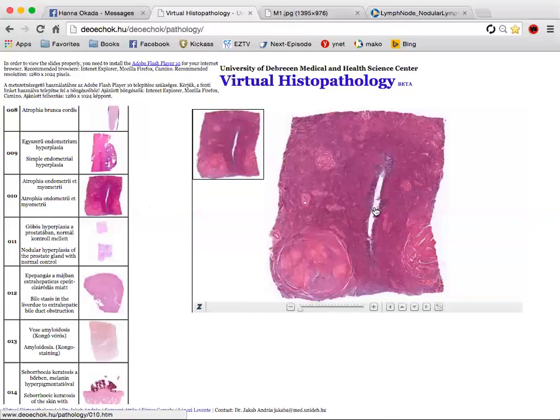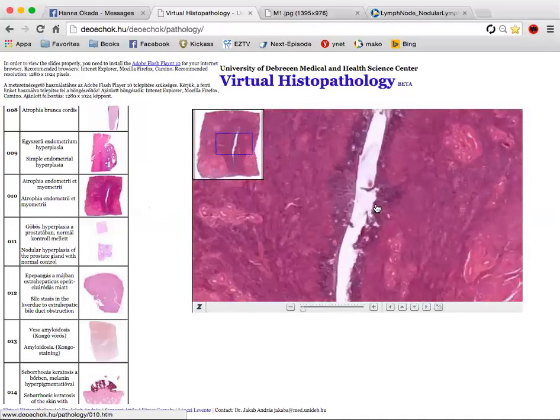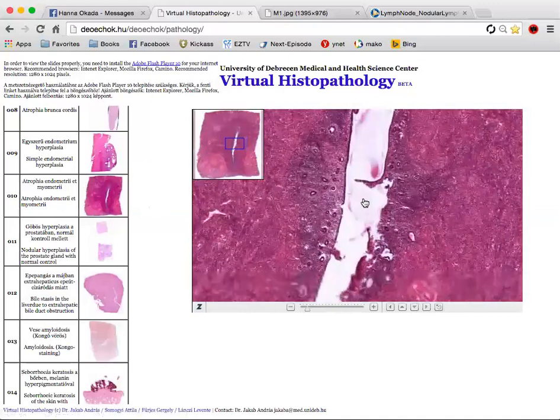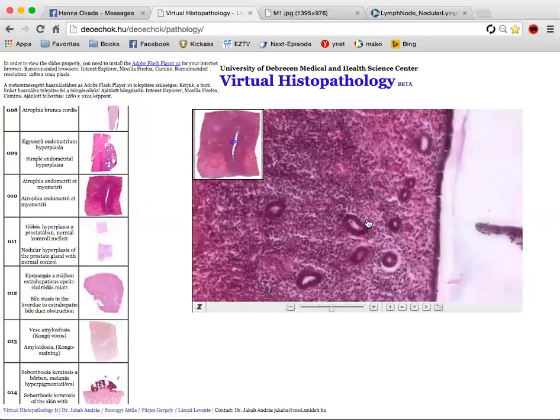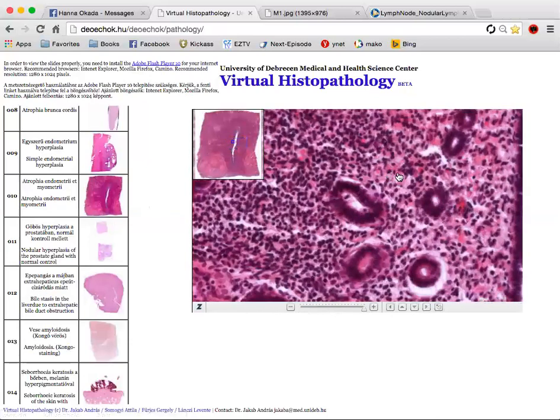What you need to know is that this is the uterine cavity. We're going to zoom in, and you can see that this would be maybe 2 millimeters. If you remember the slide from before, it was huge. When you look at these glands, you see that the lumen is very small and the epithelium is very cuboidal.